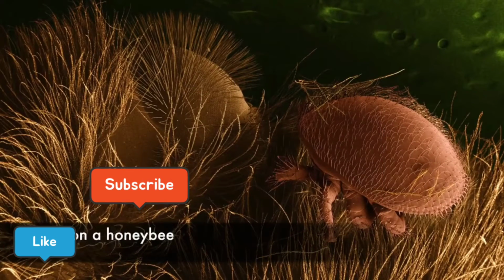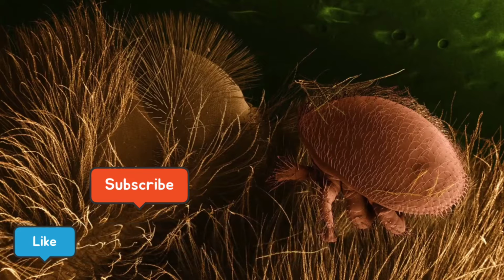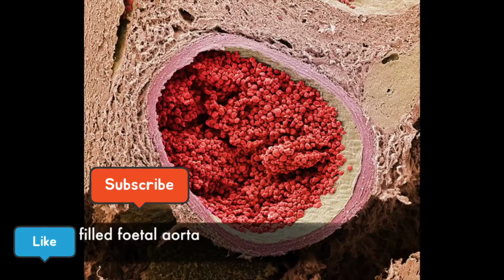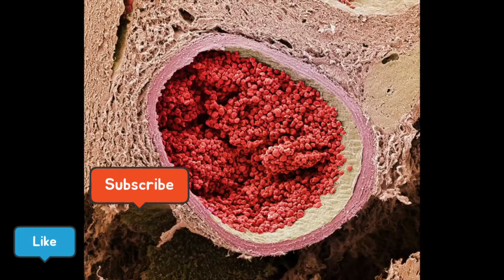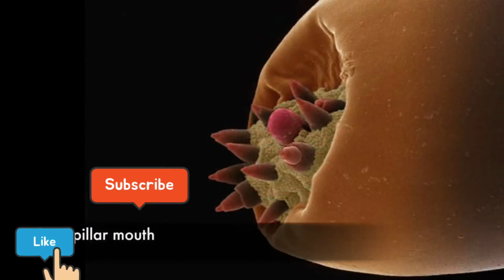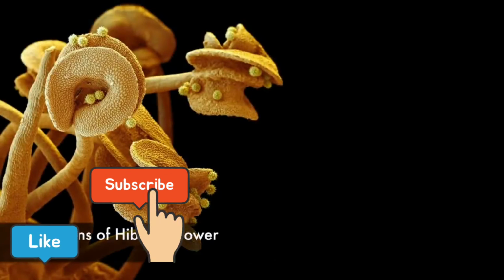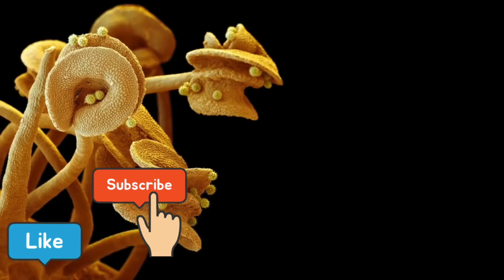A parasitic mite called Varroa destructor on a honeybee. A fetal aorta filled with red blood cells, or erythrocytes. The mouth of a caterpillar magnified 10,000 times, viewed from a distance of 5 millimeters. The stamens of a hibiscus flower with pollens.